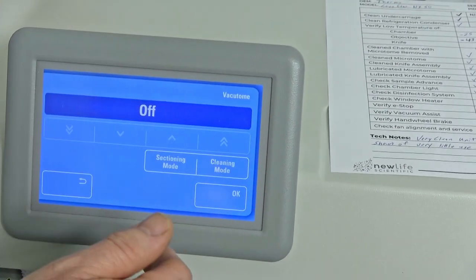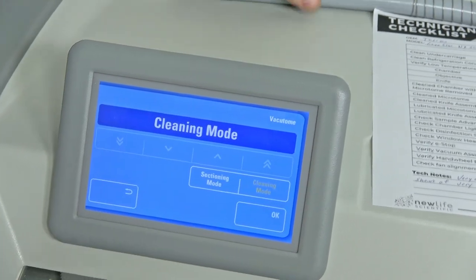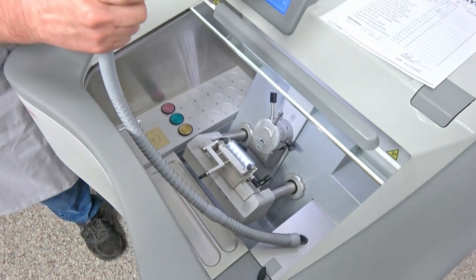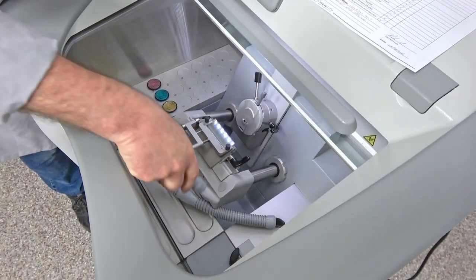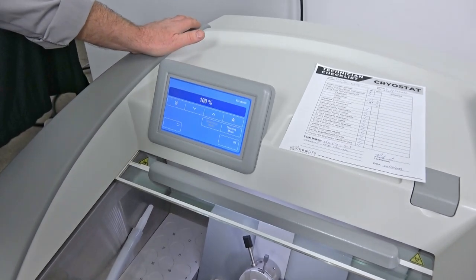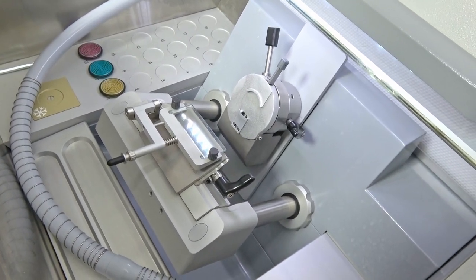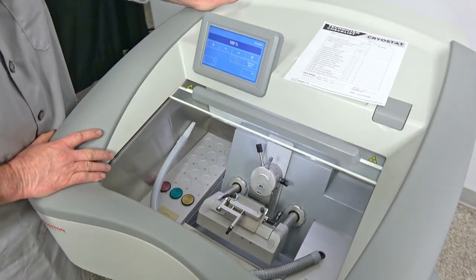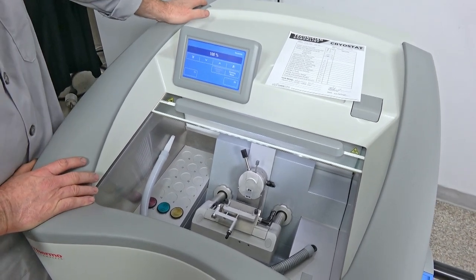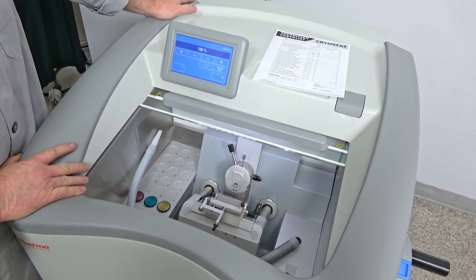This unit also has a vacuum tome option. It's actually off right now. You have two options: you can put it in cleaning mode, where you use this wand that you can plug in — you have the vacuum and you can just clean up the area and suck everything in. You also have the sectioning mode, which plugs in to the bottom here. The piece needed for sectioning is not included with the machine, but if you want to use the vacuum tome for sectioning, just let us know and we can get that piece. A lot of people don't actually use that option.